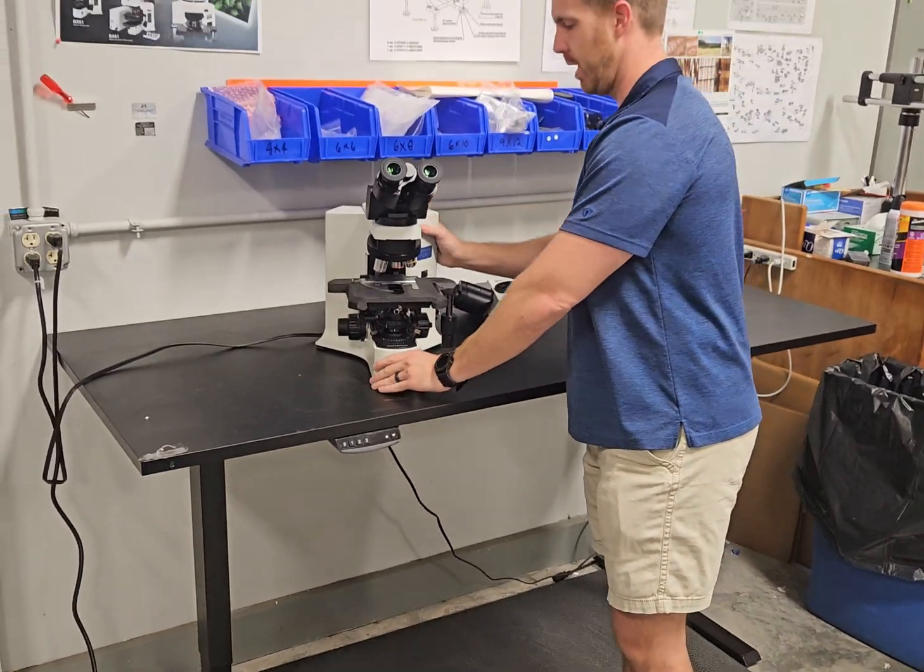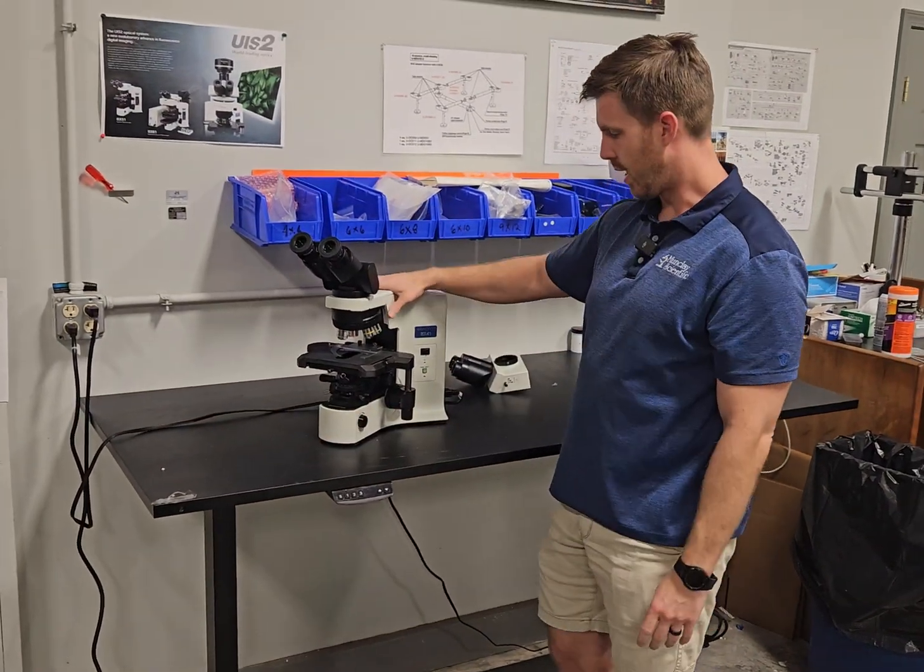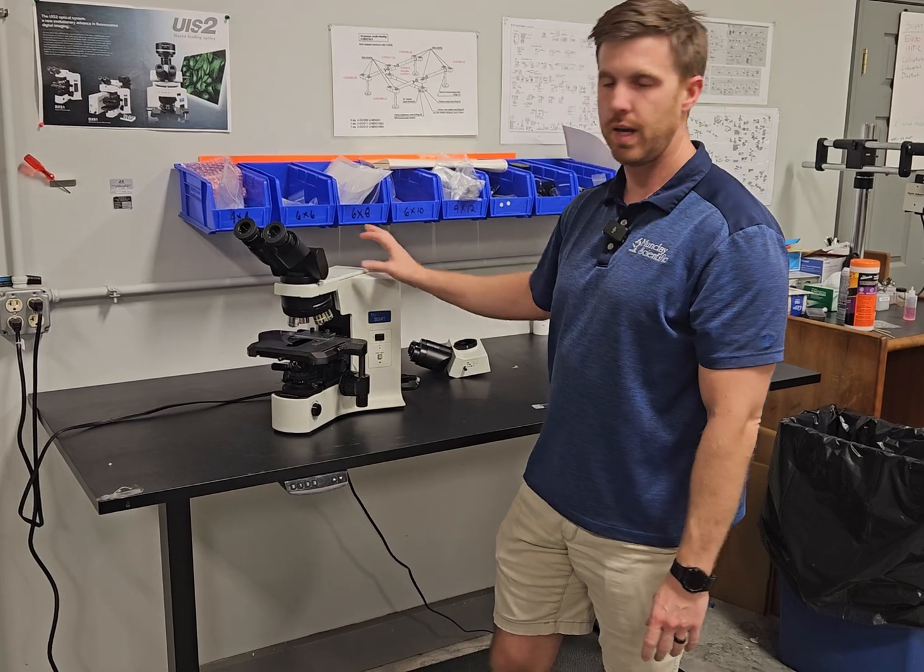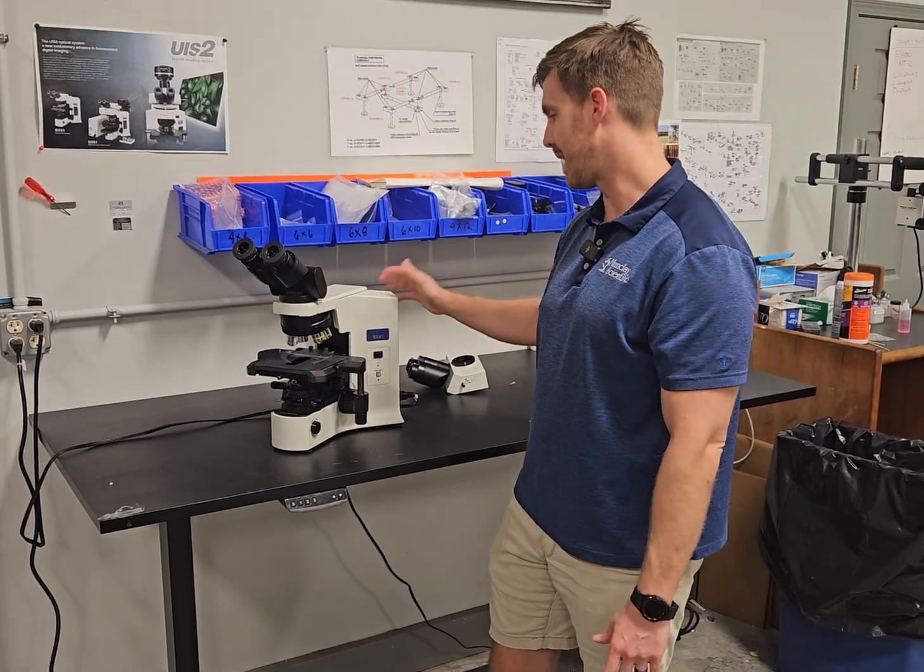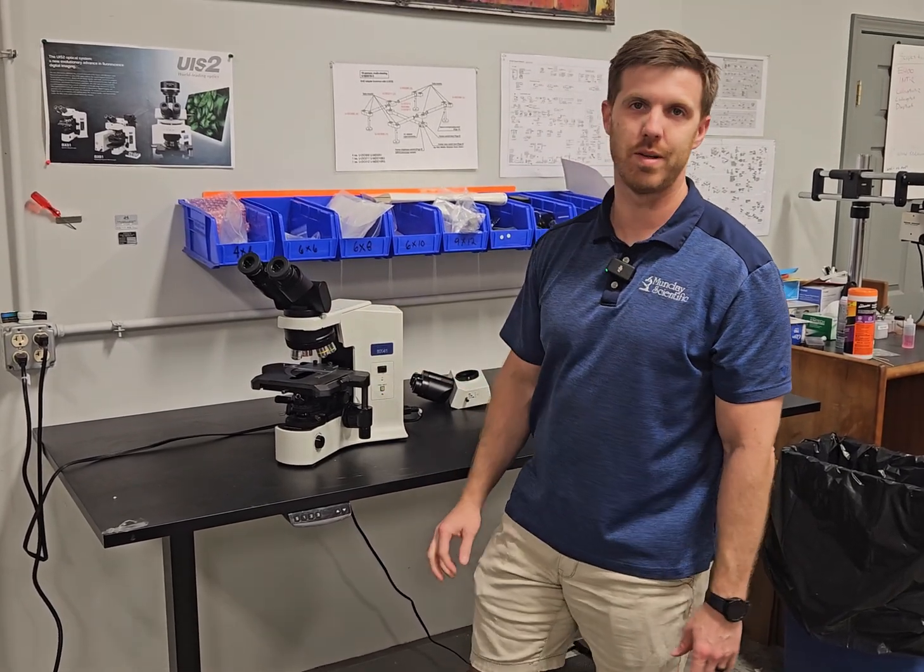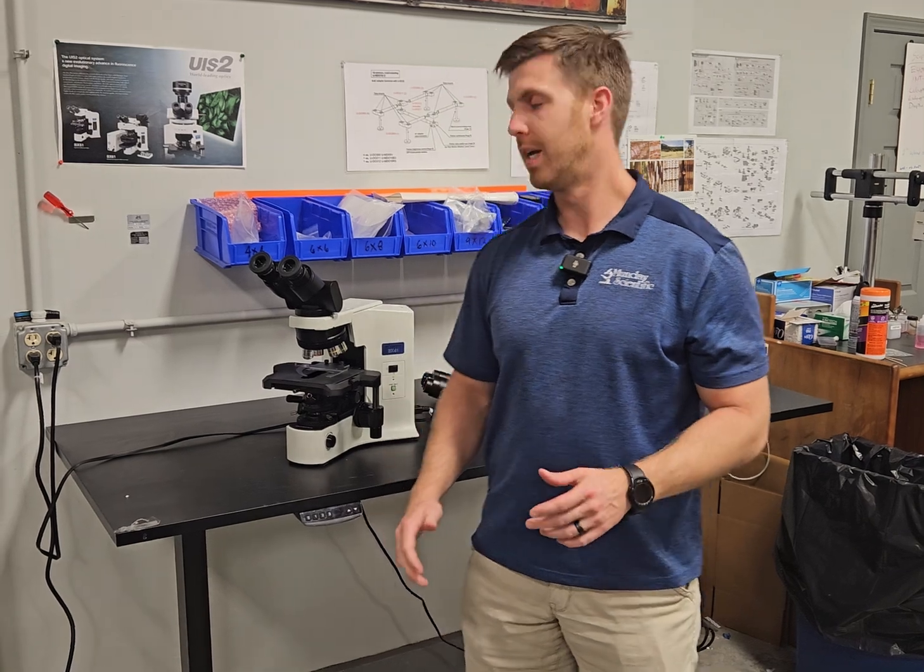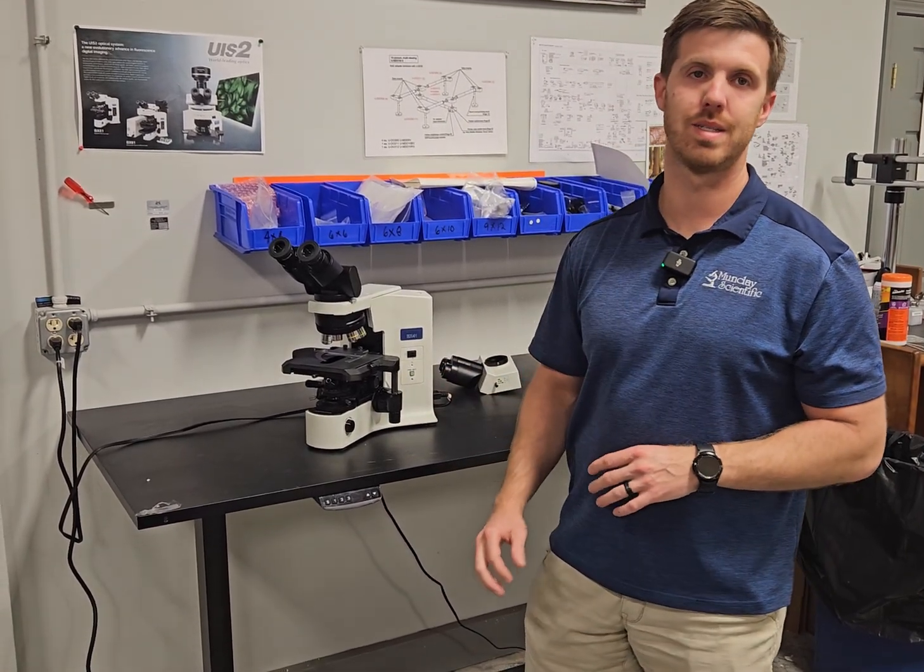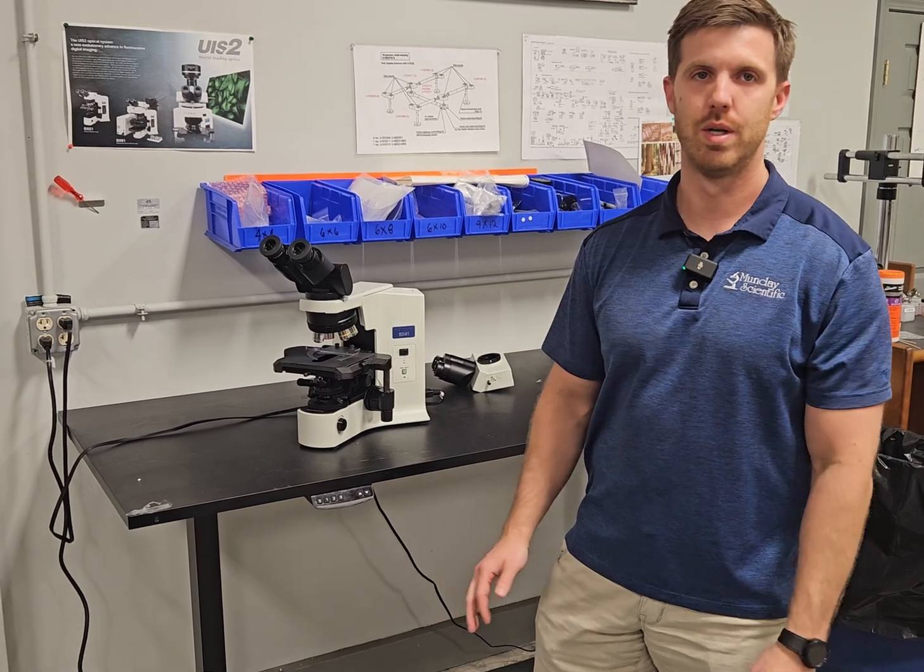I'm going to lock this head back on and that's it. That's the BX41. This thing, I love this scope. It's got a nice aluminum heavy duty frame and it's stood the test of time. These things are probably 15, 20 years old now, and they're still excellent. You can put an LED in the scope and it's literally like brand new.